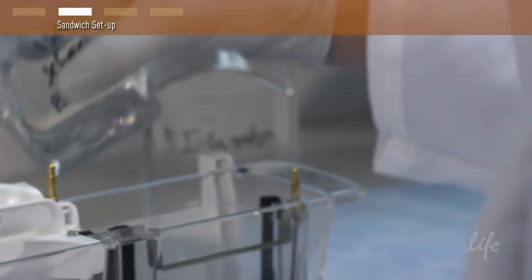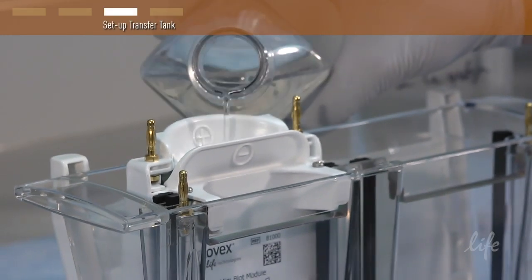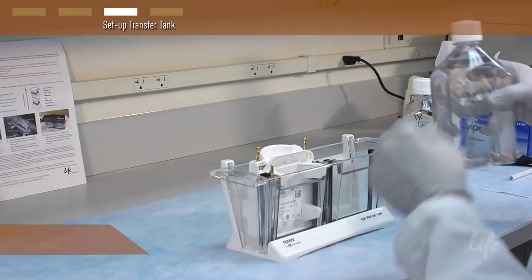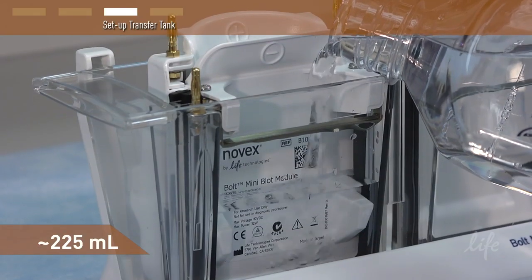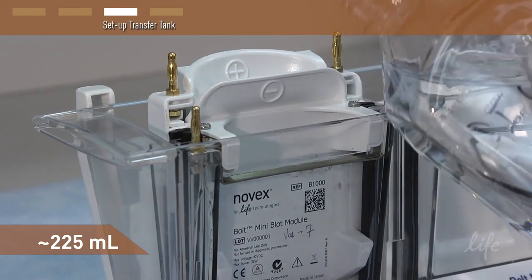Extra transfer buffer can be added to the module core to submerge the sandwich, but don't fill above the gasket. Add deionized water or transfer buffer, about 225 milliliters, to the chamber just below the electrode bar.